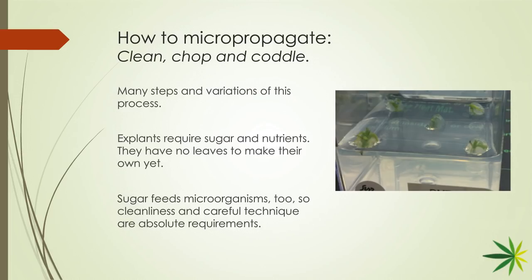Okay. All you really need to do to slow them down at this stage is just lower the temperature and dim the lights. They just slow down. They still keep growing. You still have to look at them once in a while, but they just hum along and operate at a lower temperature. Chemical reactions in general just go slower at lower temperatures, and so growth just has to go slower because of physics.